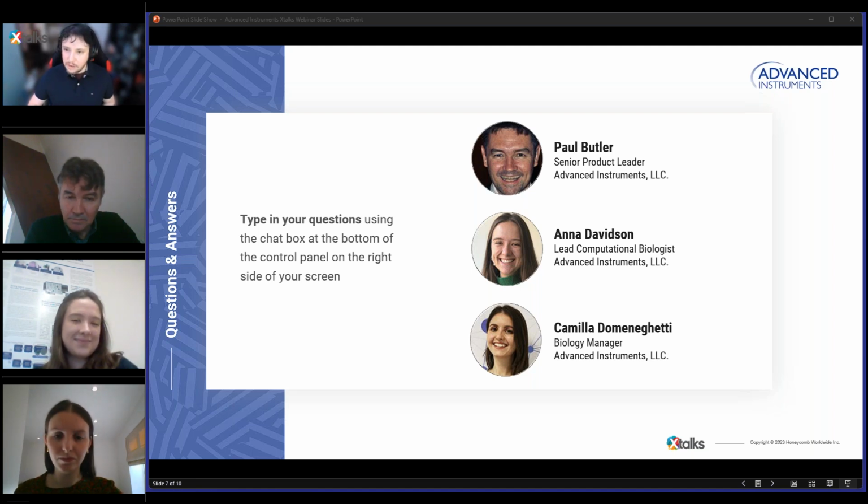Very good to know. Thank you so much. So our next question here is asking, is AEC available on VIPS Pro? So currently, the VIPS Pro is our automated single seeding system, and it's currently not available, but watch this space.